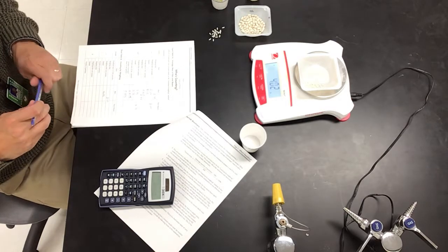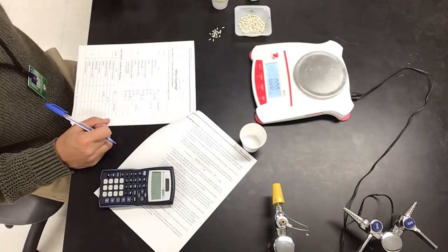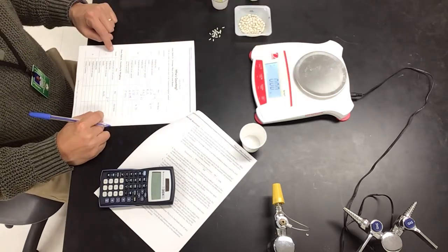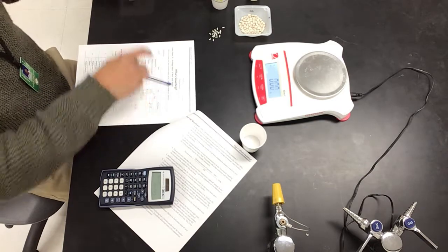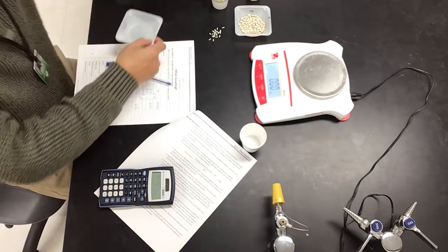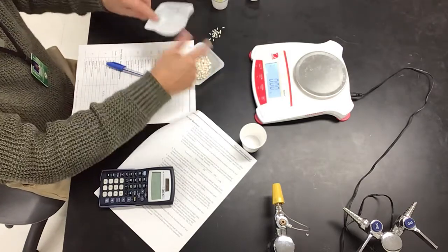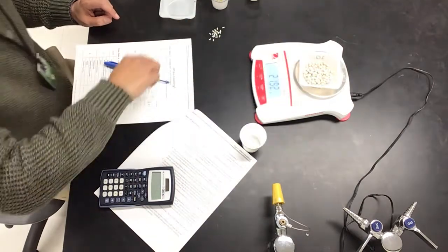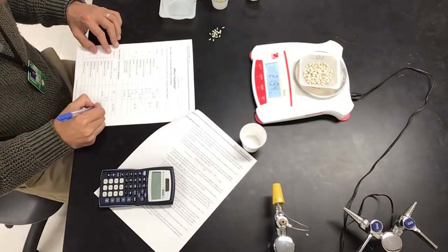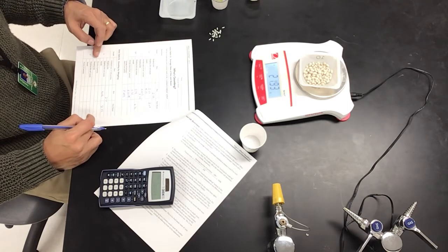For B, we're going to pick a different number. If that's 100 grains of rice, for 100 navy beans, here's 100. We use the same weighing dish so it doesn't change. 100 is 21.93. You're going to fill in the sample and number of particles.